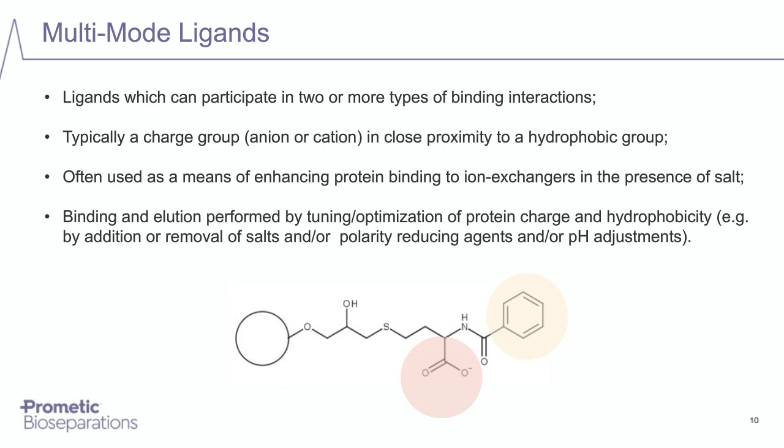So we were looking at this situation, and we're aware that we have amongst our ligand libraries many thousands of ligands with very different types of protein binding groups, and many of these can be used in a multi-mode fashion.